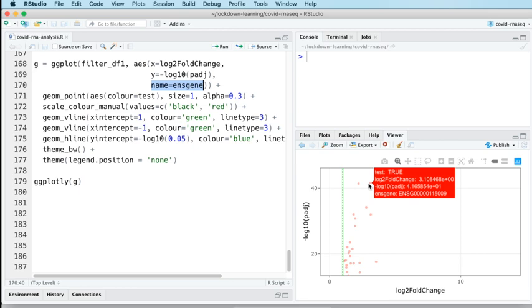And so that's the motivation behind what we're going to do today. We're going to take these Ensembl gene IDs, and we're going to do it for all of the 15,000 genes in this heat map, in this volcano plot, to show that that's possible. We're going to take the Ensembl gene IDs and map them to other annotation, features of those Ensembl gene IDs which might be useful to us. Things like gene symbols, gene descriptions, maybe chromosomal locations for genes, and some other things besides.